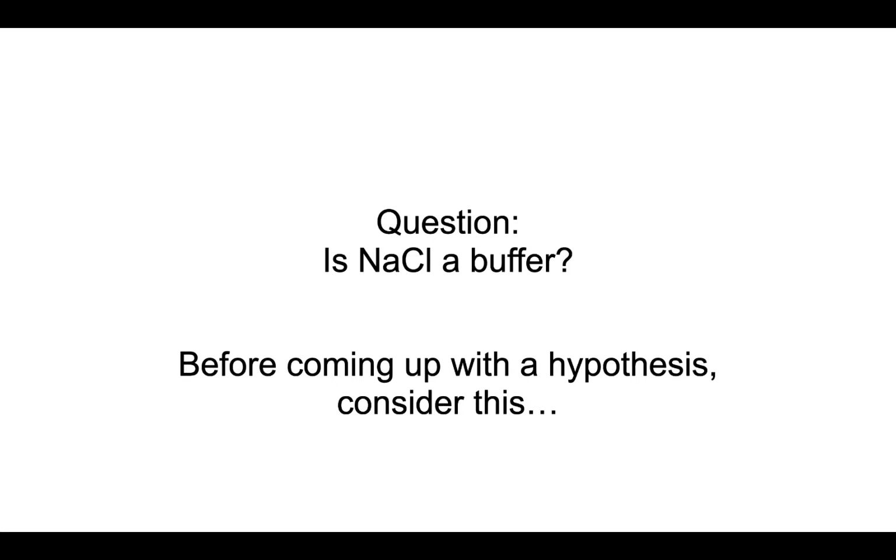All right, so this week's lab, the question that you're asking is: is sodium chloride a buffer, right? That's our scientific question that we're dealing with this week. Now, before coming up with a hypothesis, remember, you need to come up with a hypothesis, a hypothetical answer to this scientific question, but you do so before you do any experiments. Okay, so you normally won't have any data before you see this.